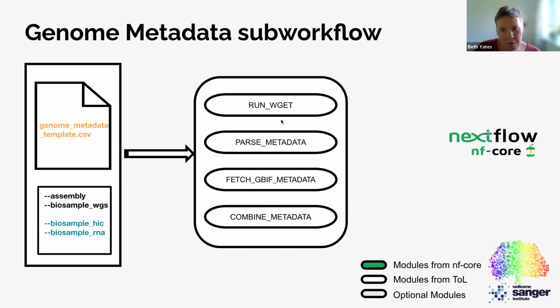We will then parse those, open those files, read them, pull out the information that we want from them, and write them out to a file. So each of the different resources will produce its own file, which has a list of parameter names, which are essentially the placeholders that you saw within the template, and the value from that source.